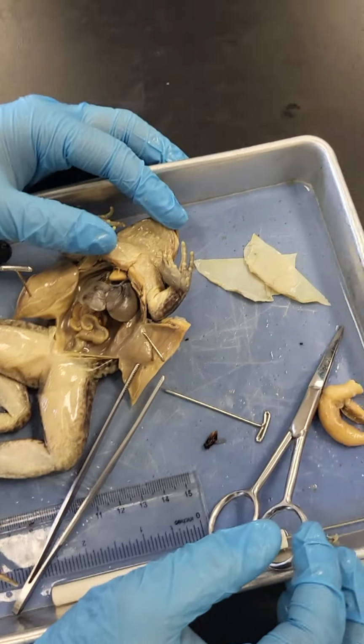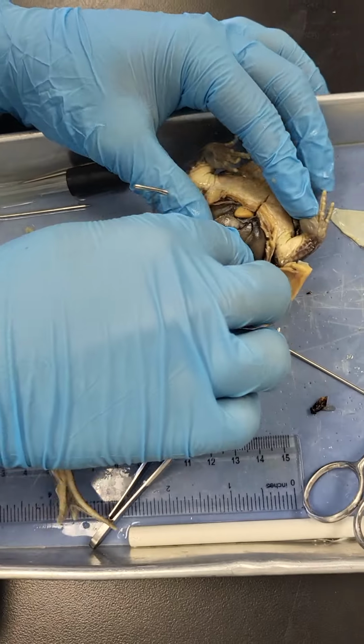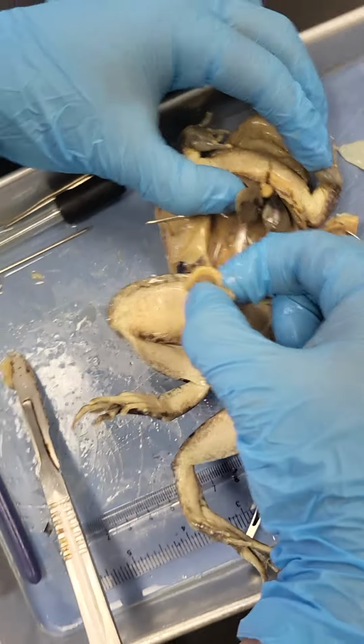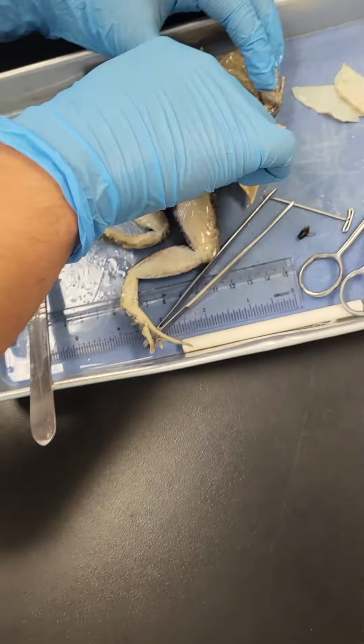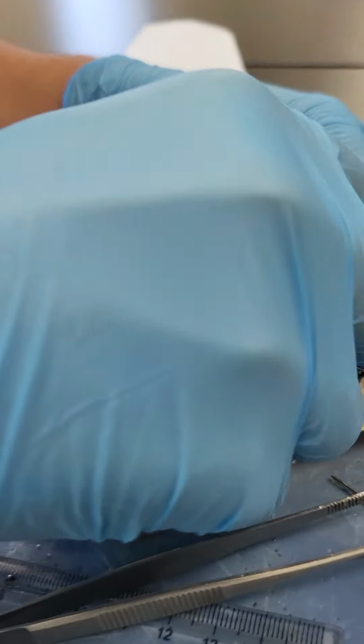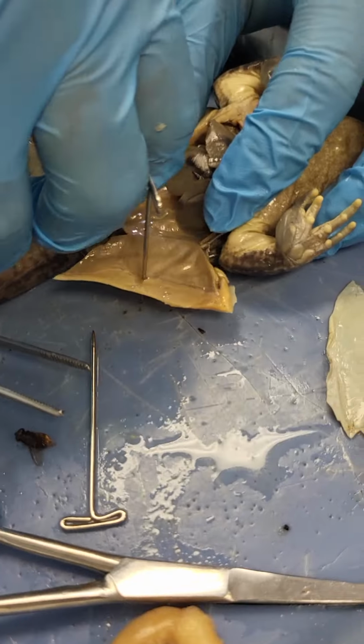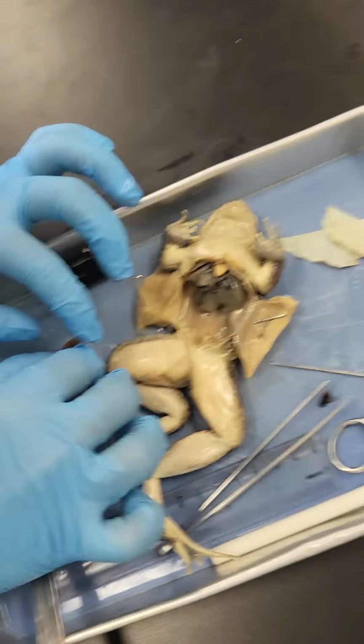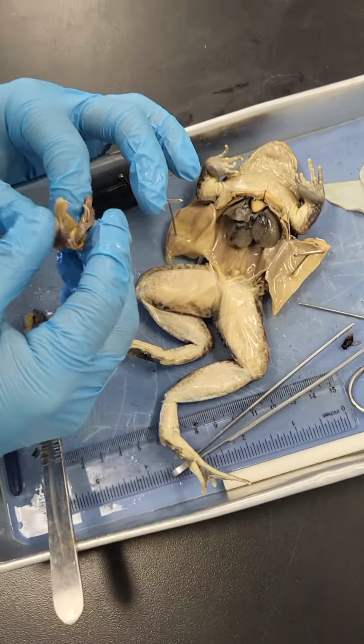Actually, this may be measuring the small intestine. This may be a male, because their female is really big. Yeah. It could be a male or female, actually. Oh my gosh. Use a tweezer or something. Imagine doing this with no gloves. He didn't even go for the tweezers, bro. Alright, I'm gonna stretch it out and measure it.